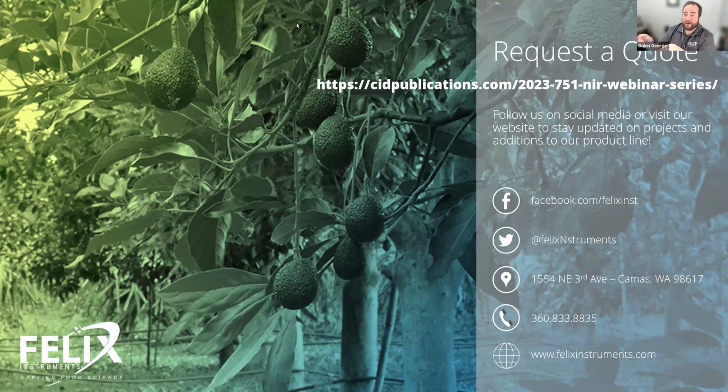And so that's where, if we're inputting new data into this regression, right? Because chemometrics is taking that database and simplifying it down into a regression equation, essentially. Then that regression equation is taking the input spectra from this new spectrometer and running it through that regression equation. And if that regression equation doesn't factor in new spectrometers or variability in spectrometers, you're going to see variability in the predictions that come out of that equation.